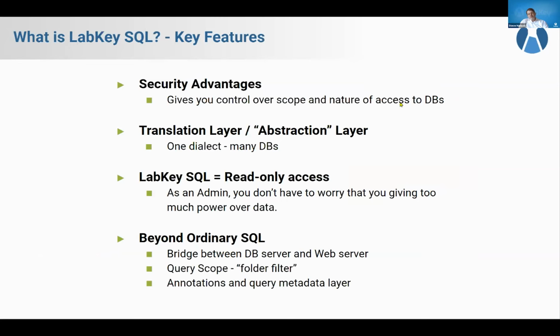So there are some really key features to LabKey SQL that set it apart from just any old SQL dialect. There's more than I can even list here in the time allowed, but I think these are some of the most important ones. First, there's enormous security advantages. It gives you a way to control access to the database in a way that's a lot easier than if you're just a database administrator trying to give out access all alone without any sort of application layer. It also forms a translation layer between all of the other SQL dialects. You really only need to speak one dialect to talk to all these other databases, and we'll get into more detail on that.